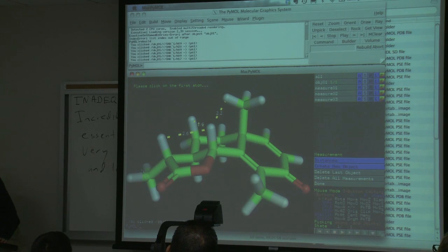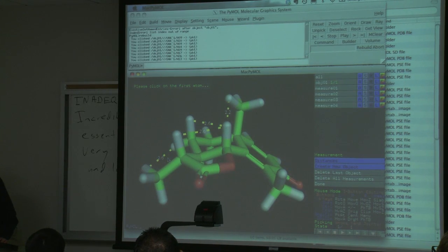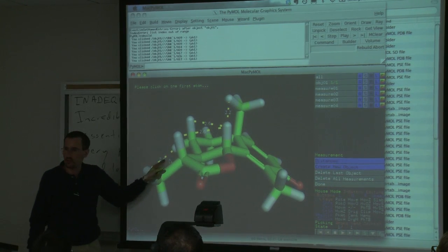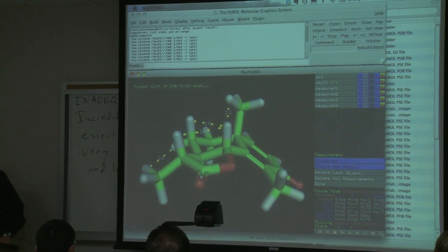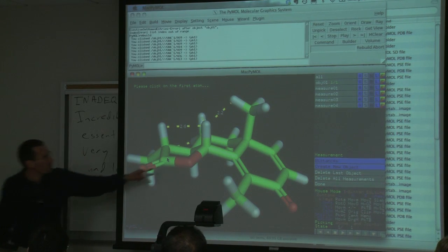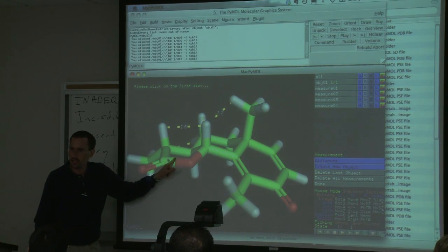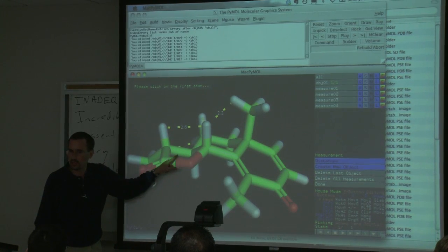The other one, which was a little messier to see, was when we irradiated the methyl and we saw the NOE over to this other hydrogen; again, that gave us our stereochemistry here. And you notice this structure with the cyclohexane and the 5-membered ring is basically what I'm talking about with the transdecaline. And your 5-membered ring, the conformational analysis, is essentially that envelope cyclopentane.